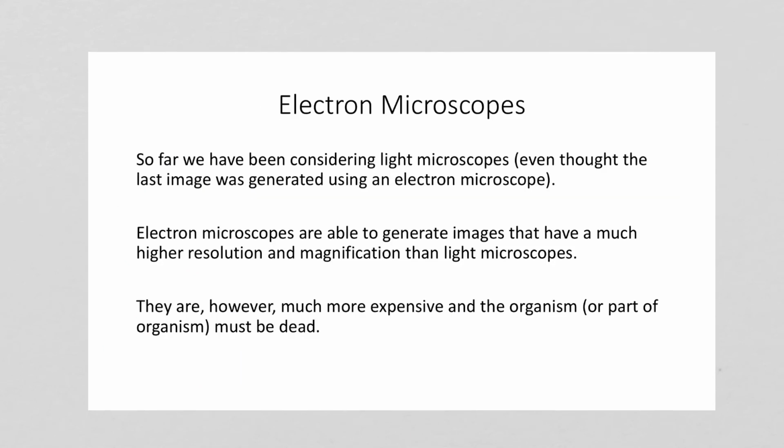And that brings us to electron microscopes. So most of what we've done for this lesson was with light microscopes. Remember when we drew our beautiful diagram of the onion cells, all you could see was the cell wall, the nucleus, and the cytoplasm. You couldn't see the ribosomes, the cell membrane, or the mitochondria, nothing in the cell except for those things, because those are the only things that are visible using a light microscope. The other stuff is too small.